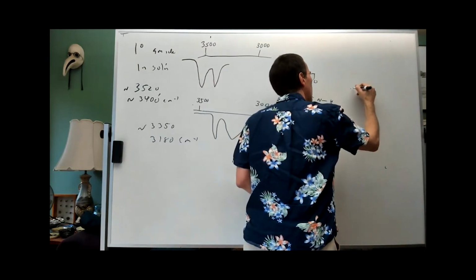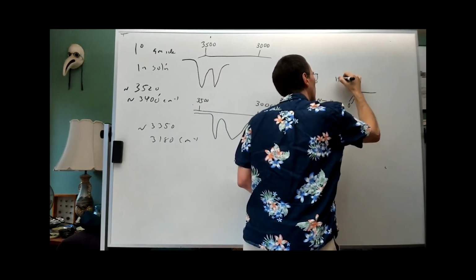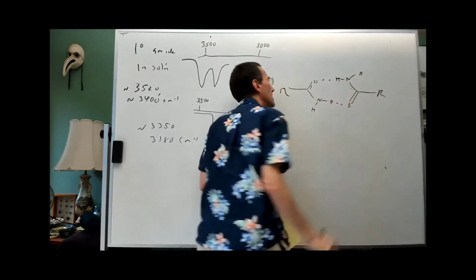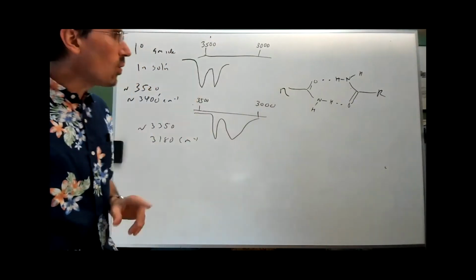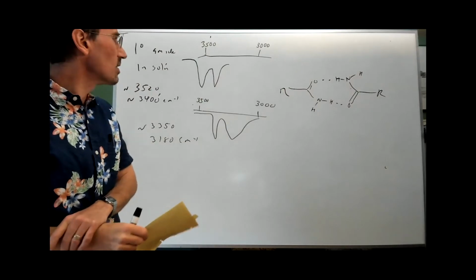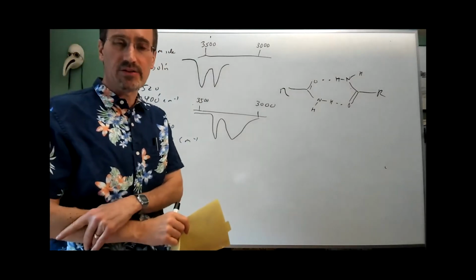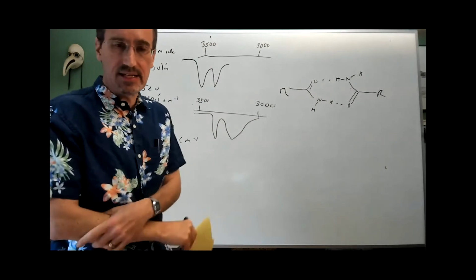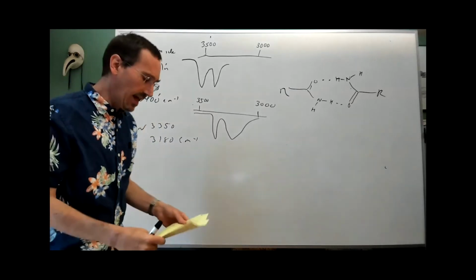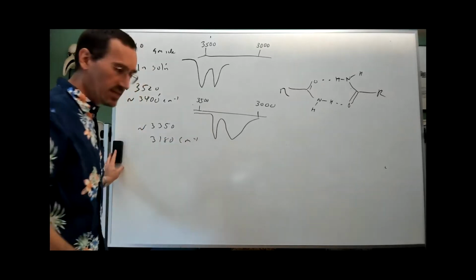And so it's set up nicely to hydrogen bond, like so, and that tends to broaden out the stretching. It's not quite as strong hydrogen bonding as carboxylic acids, but it's still pretty significant. And if you ask for my least favorite compounds to chromatograph, carboxylic acids, primary amides, primary amines are all pretty lousy on silica gel chromatography just because of hydrogen bonding and poor separation.